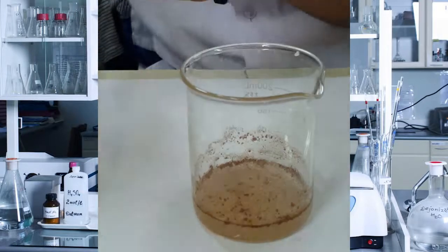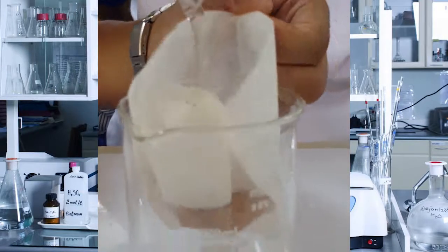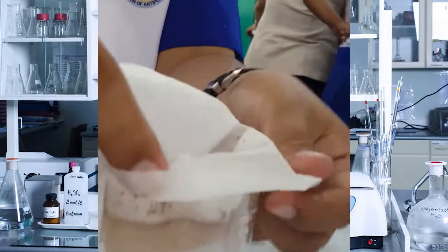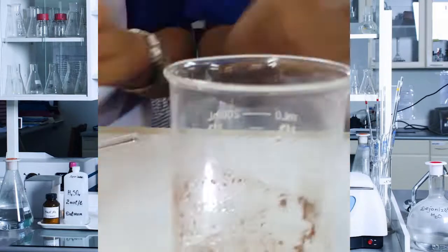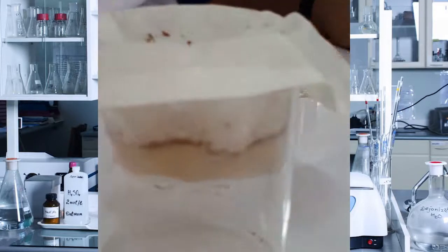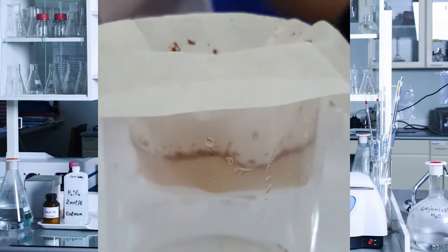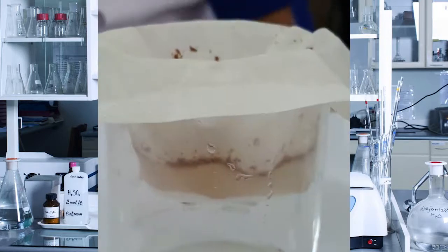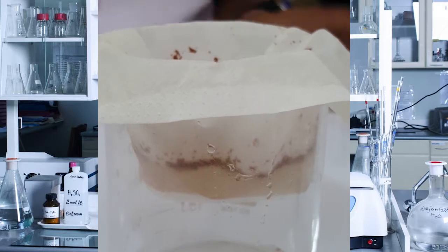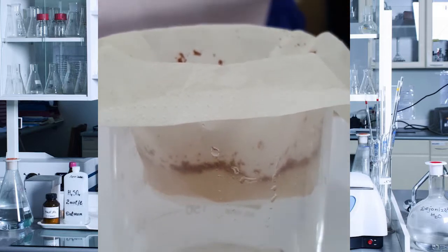After that, it can be seen that the mixture resulted as a suspension. Then we tried to separate the mixture with a filter paper. The mixture was separated, as seen with the particles of salt and cinnamon stuck in the filter paper.